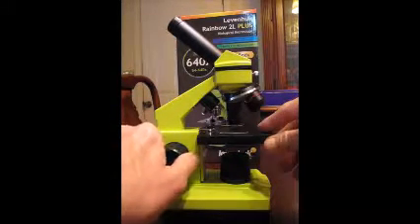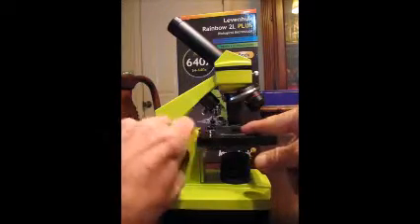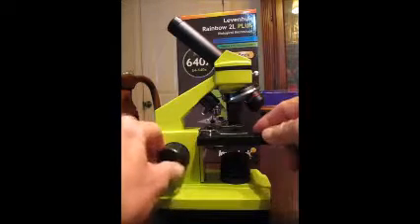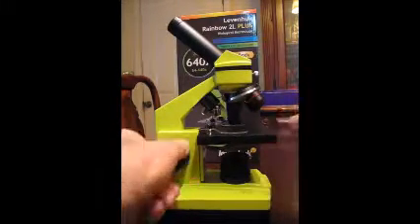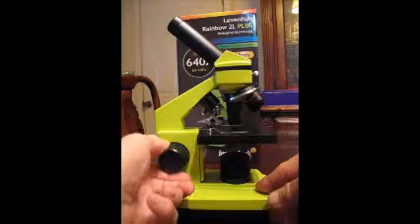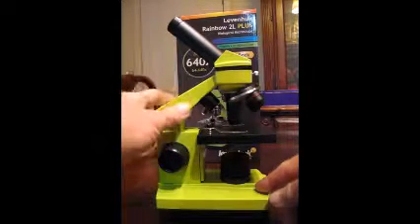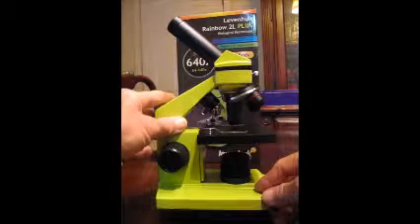Here's the stage where you put the items on. You've got spring-loaded clips that hold the slides down. It doesn't have a fine control, but this one has a very smooth control and you can dial it right in to get the right focus.